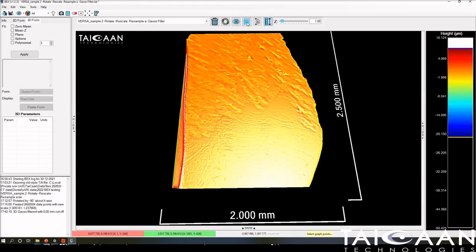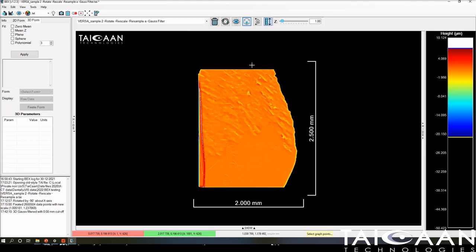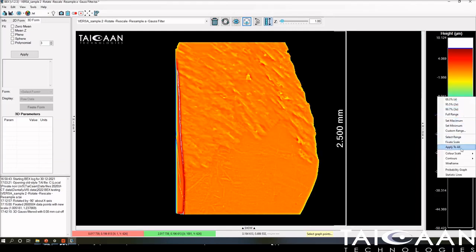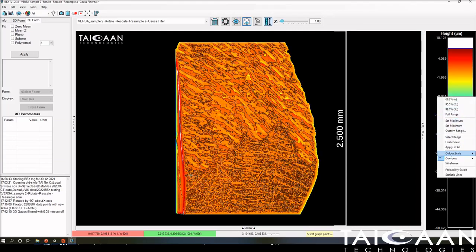Now, to do this, we have to use the top-down view. So I'm going to use the planar view here, just looking down on top of the surface. And here it is. Let's just zoom in. If we wanted, as you know from previous, we can add contours to this and make the image much more visible. Let's try that for a second. You can see here the surface is rough in sections and not so rough in other sections, but let's remove that.